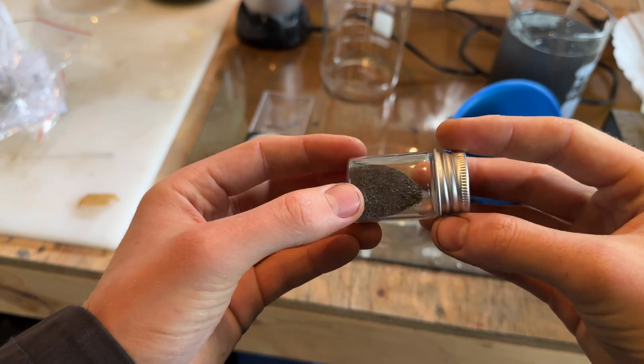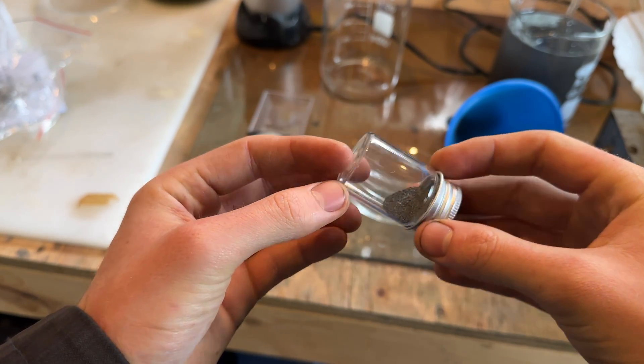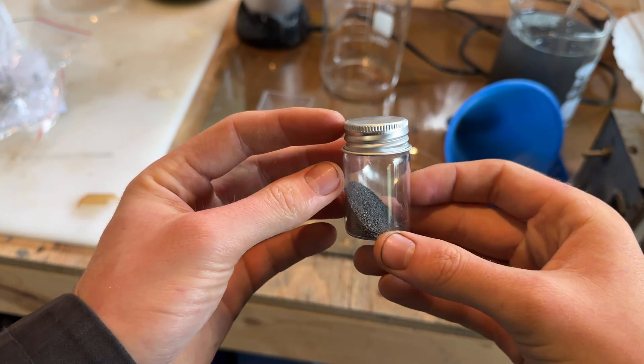Hey guys, and welcome back to How to Make Elements from Household Materials. Today's element is going to be tin. Specifically, I'm going to show an easy way to make finely divided tin, which is more useful than chunks of tin for chemical reactions.